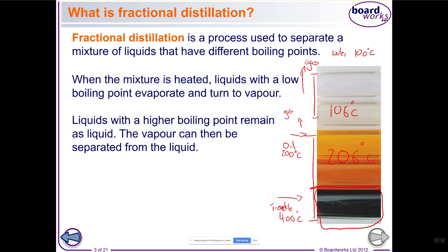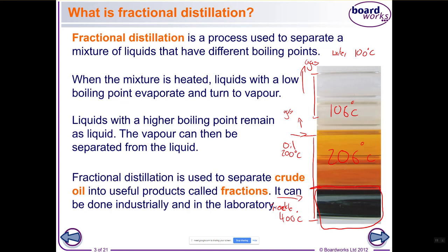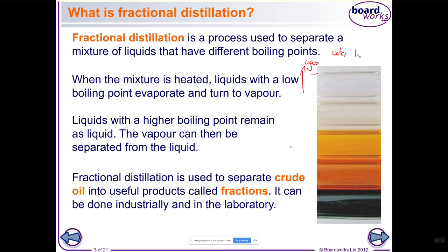Yes. Nice. So fractional distillation is generally not used on water, oil and treacle. It's actually much more commonly used on the crude oil that we dig out of the ground, which we learnt about in our previous lesson. And that's because crude oil is made of a huge mixture of different chemicals, and they all have a completely different boiling point from each other.